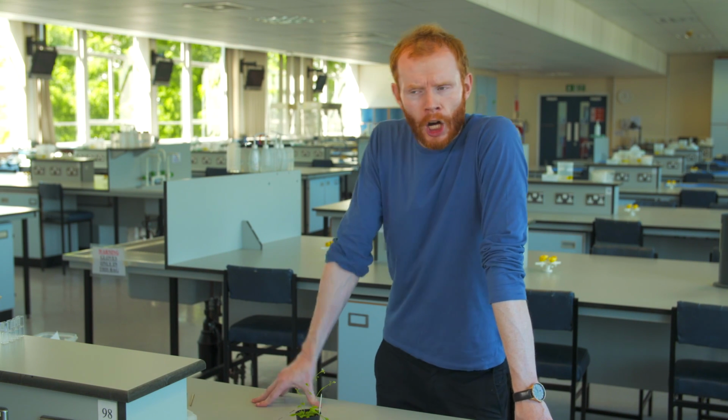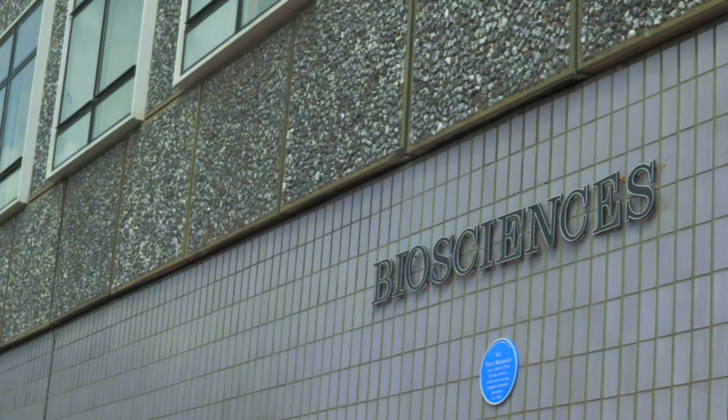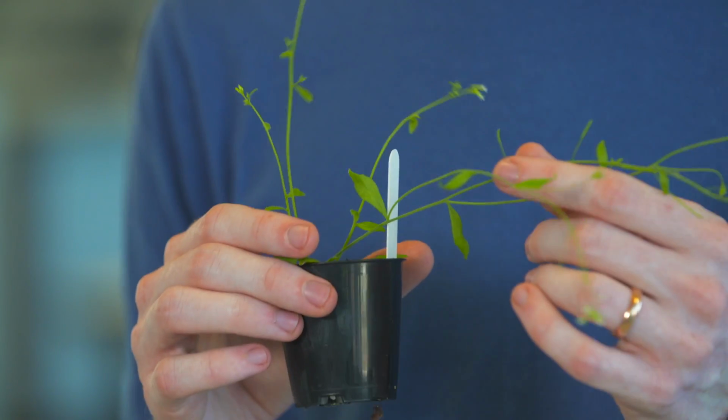Enzymes and their action are widely studied in biochemical laboratories across the planet, and here at the University of Birmingham's School of Biosciences, it's no different. Researchers are investigating the role of a particular group of enzymes called pyrophosphatases in establishing self-incompatibility in plants.